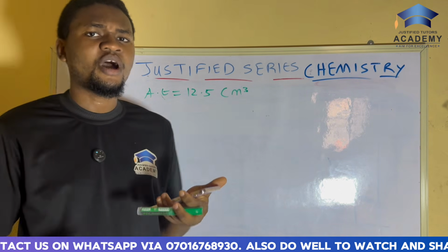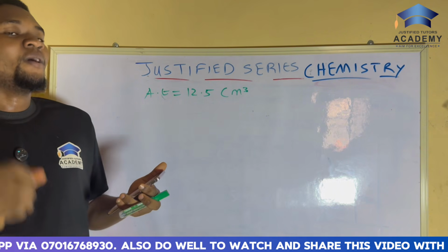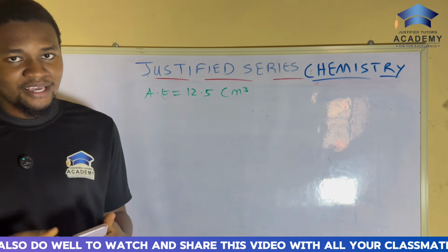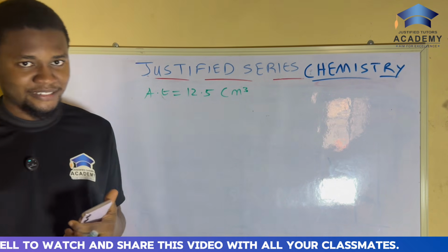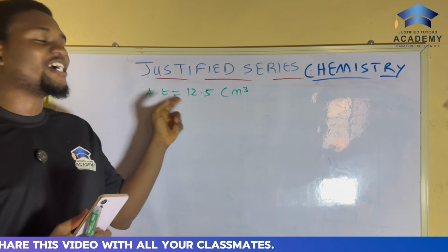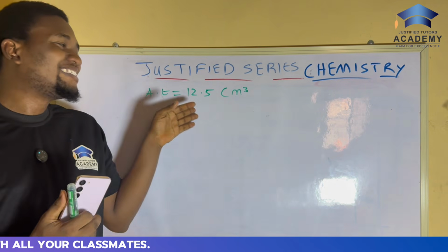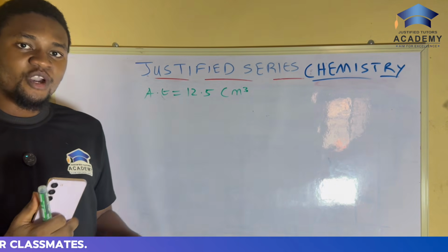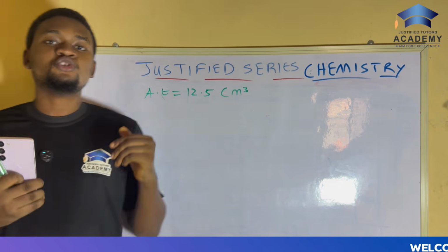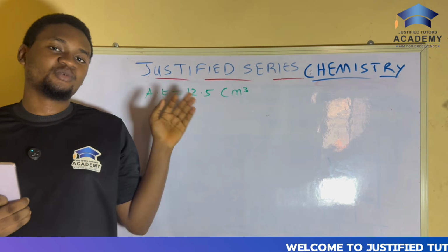Now I said I was teaching you how to get your table. Now you see, one thing that WAEC needs is this. This is what WAEC needs. So your average titer value must correspond with the one your teacher has. So that is the value that we check. Once it corresponds, you have your mark. But once it doesn't correspond, that's when you fail it.